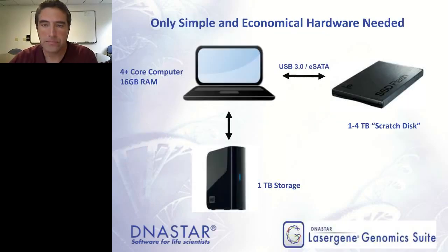So the type of hardware, if you're thinking about doing your own assemblies, rather than maybe having a core facility assemble for you, or if you are a small core, and you want to produce an output file that your researchers can use more easily, one of the first considerations that you'll have is the type of hardware that you would need to invest in.